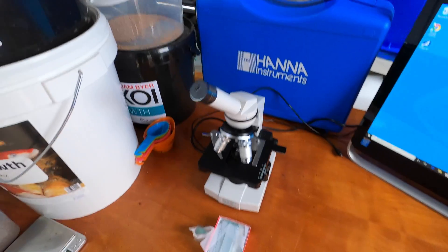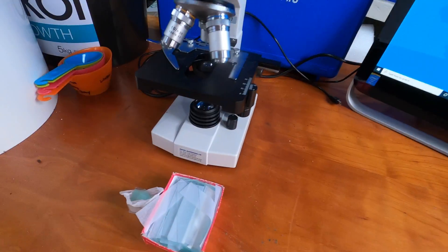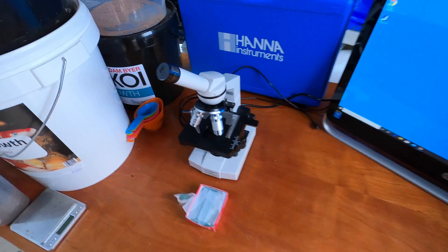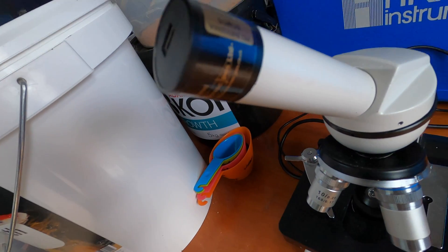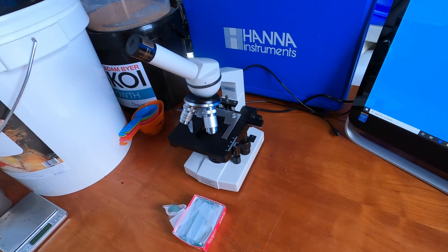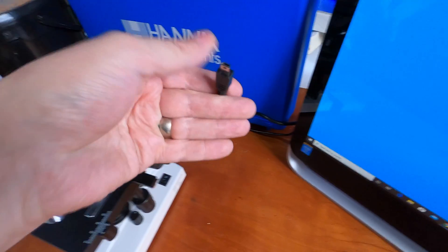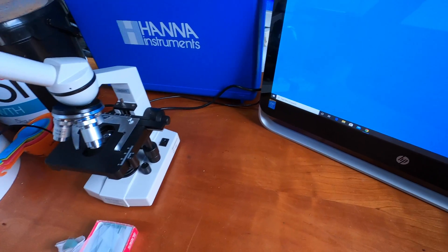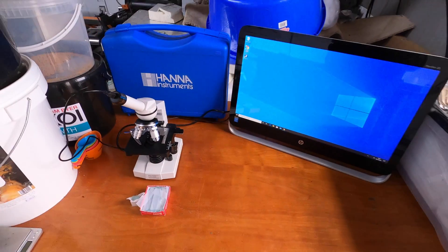Here's the microscope — this one's quite an old one, it's a Brunel, I think it's an SP20, could be an SP25. Attached here on the end, that's the Apex Mini Grab, and basically what that does is replace your viewfinder. So instead of looking down the scope, it plugs in with a mini USB already connected to this PC, then transmits the image through an app called Image View.